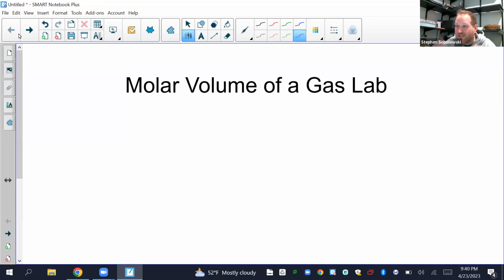Hi, everyone. Let's talk about one of my favorite labs of the year, the molar volume of a gas lab. I love this lab because it's a real culminating lab that really brings together so much of what we talked about throughout the year. As I go through this video, you're going to see all the different concepts come into play. It's a great lab to run near the end of the year, brings together a lot of information. Let's start going through it.